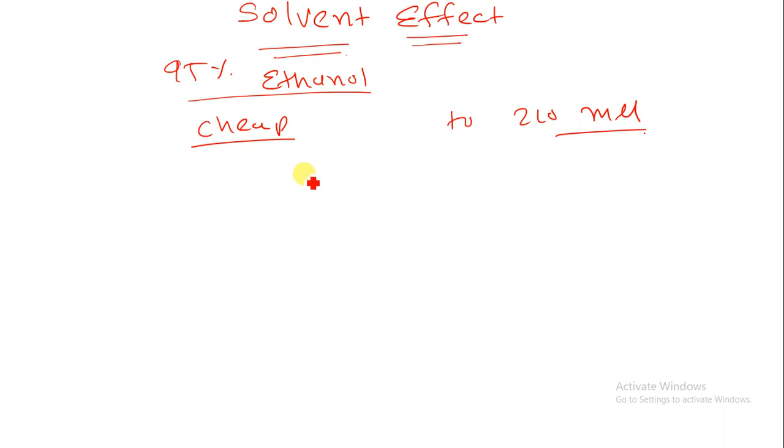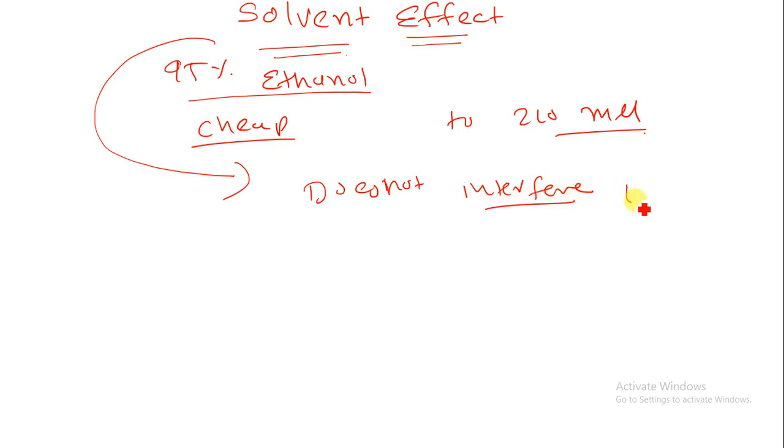You have to remember that whatever the solvent you are using, it should not interfere in the UV region, let's say 200 to 400 nanometer.